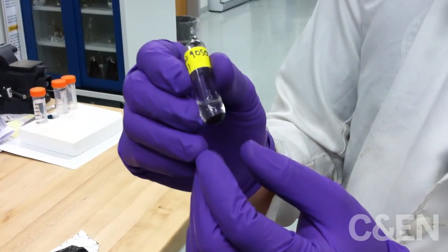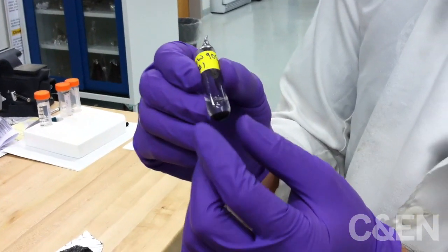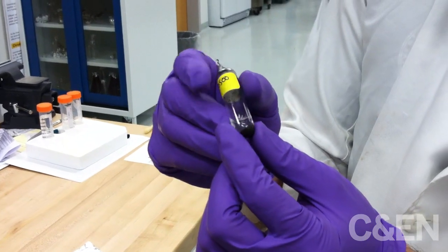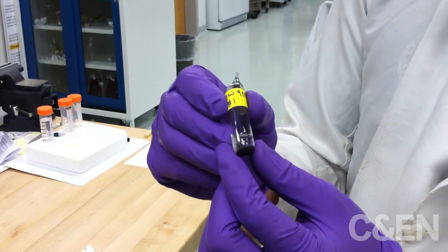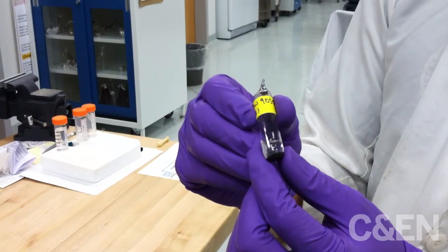The next thing we do is extract these meteorites. We put a little bit of the meteorite powder into a solution of formic acid and heat this up at 100 degrees Celsius for 24 hours.